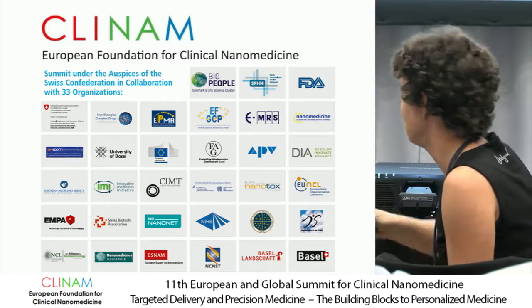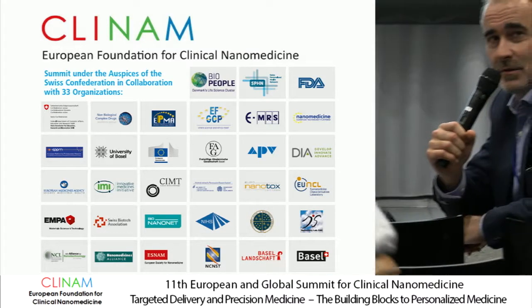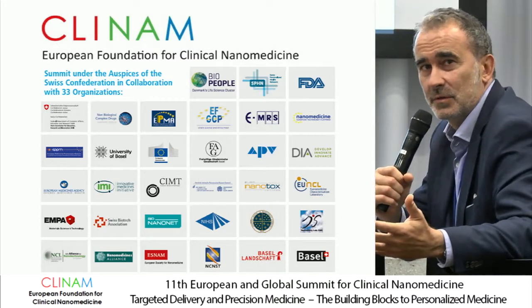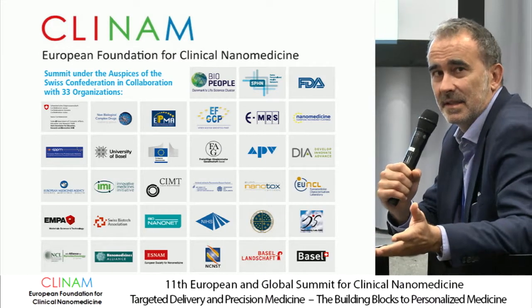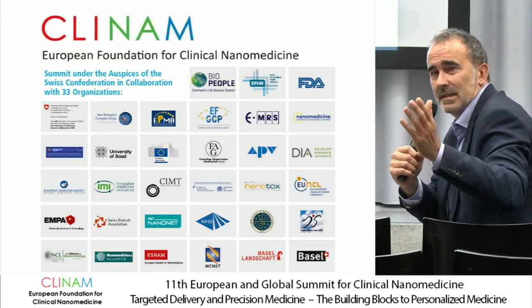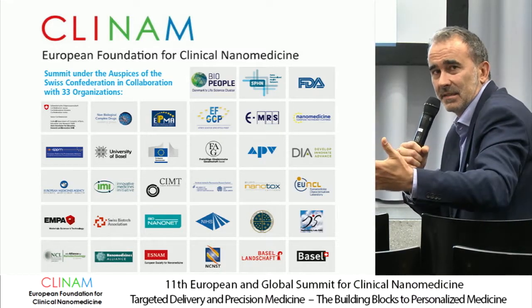So, concerning this reference material point, I think we have to really distinguish between a system suitability test, where we use these latex beads, these NIST standards, to see if the system itself allows a measurement in the size range where we later expect the particles to be.